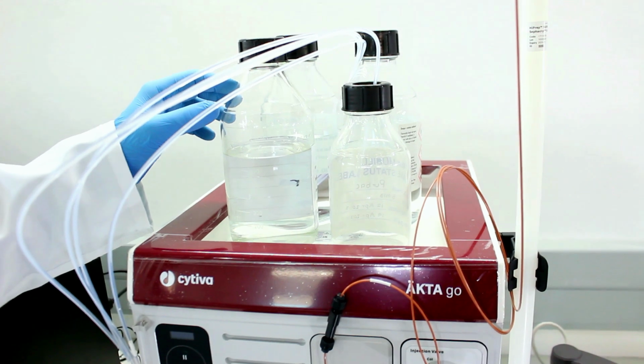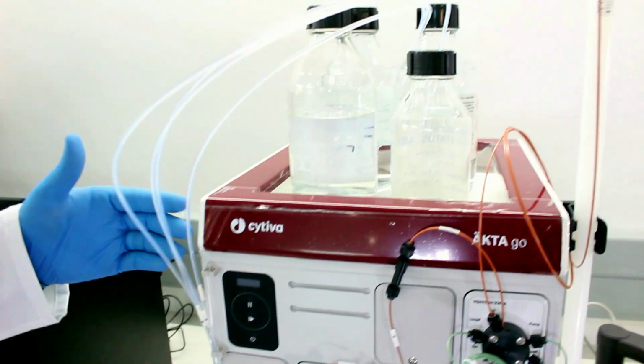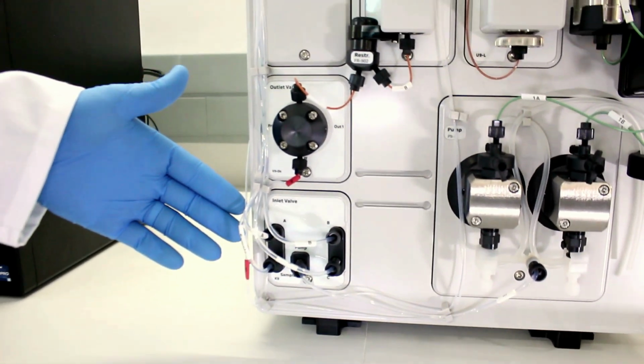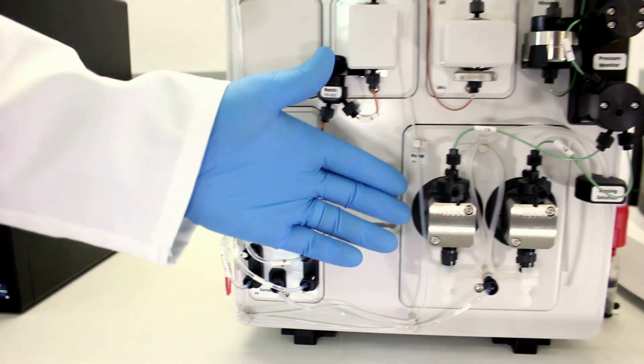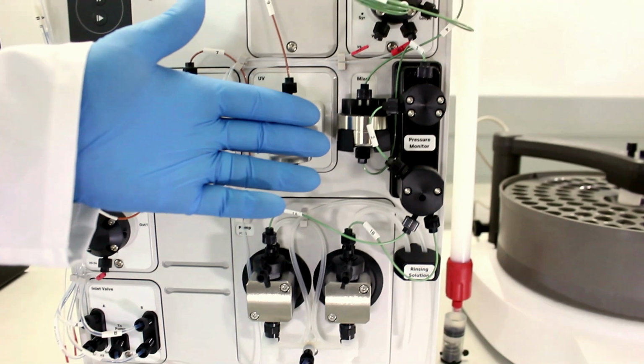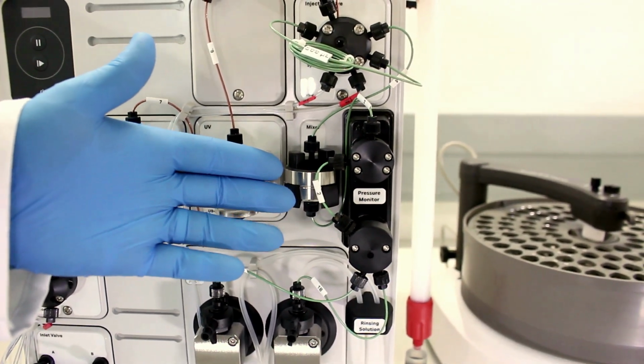From there, we're going to look at the solvent tray. We've got our mobile phases as well as our sample up here. The flow goes down through the tubing into the inlet valve. From here, the flow will go either to the pump, which is located here, for the solvents, and then from there into the mixer to make sure your mobile phases are properly mixed before they are introduced to the column.